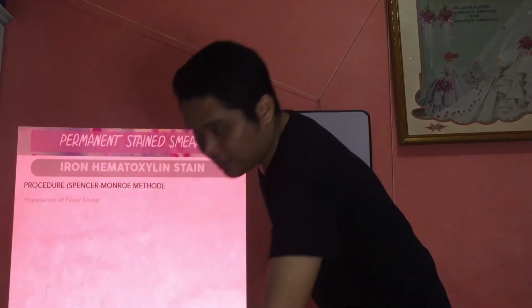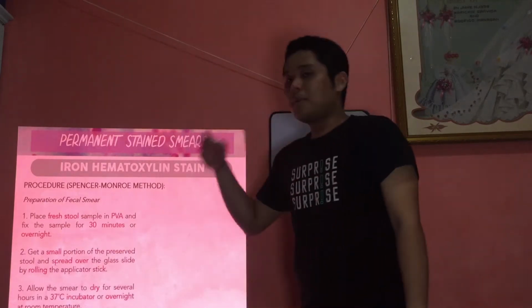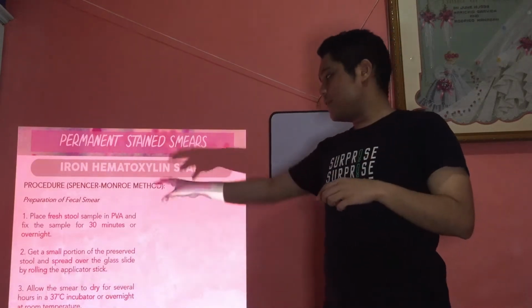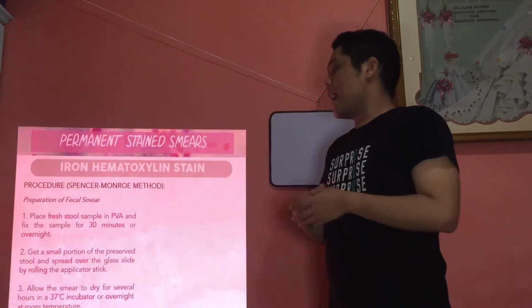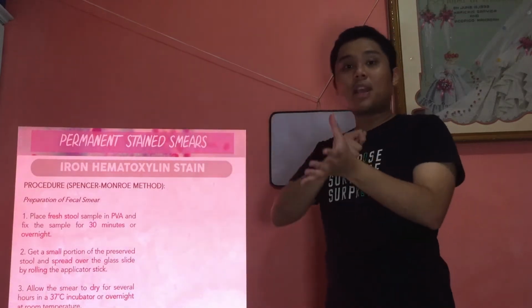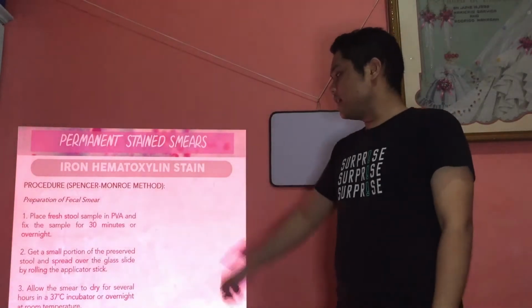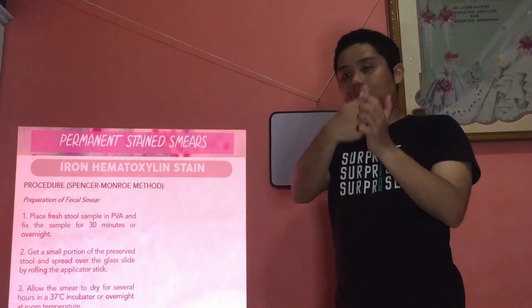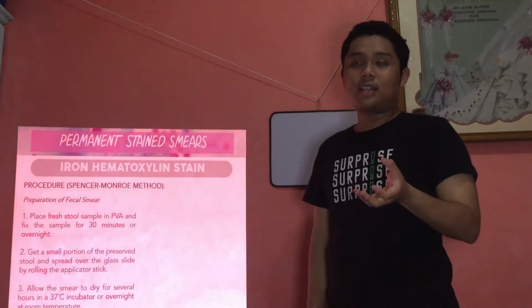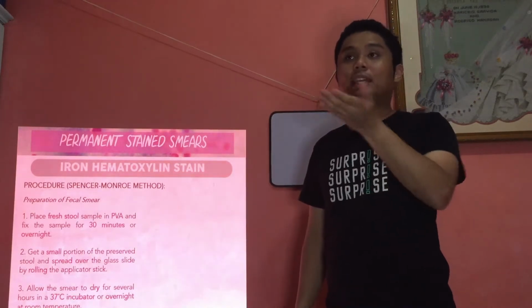We start with the preparation of your fecal smear by placing your fresh stool sample in PVA for 30 minutes or even overnight to fix it. After fixation, we get a small portion and smear it on a slide using an applicator stick. Make a thin smear, spread over the glass slide by rolling the applicator stick, and then let it dry, either overnight or at a 37 degrees Celsius incubator. If you want to hasten the drying, you can put it in the incubator.